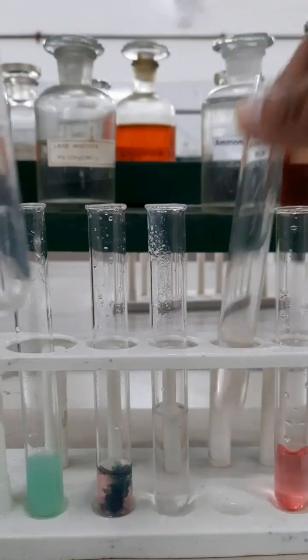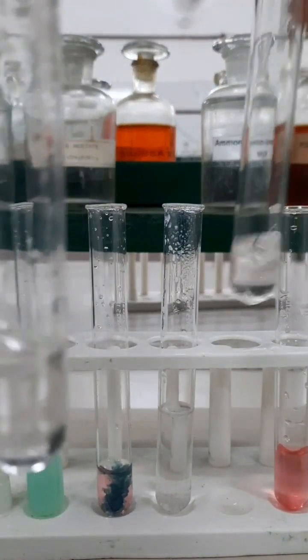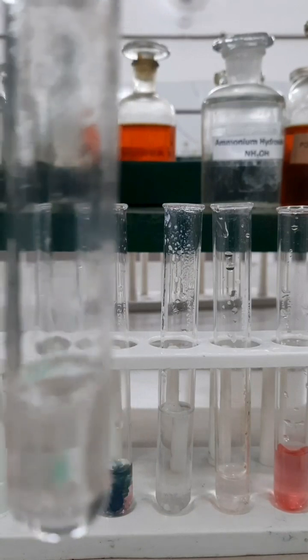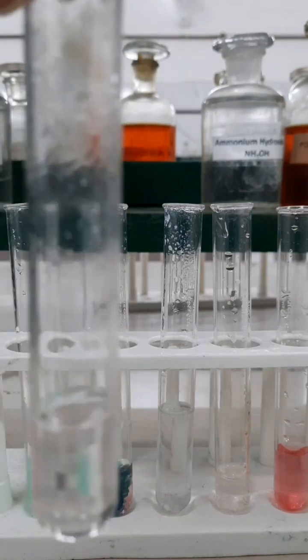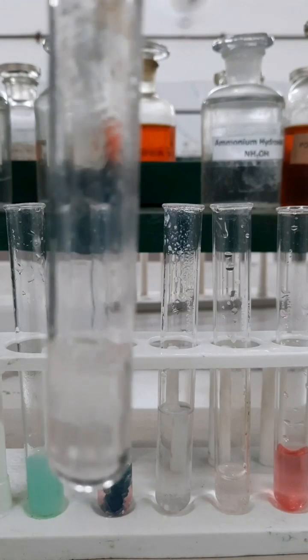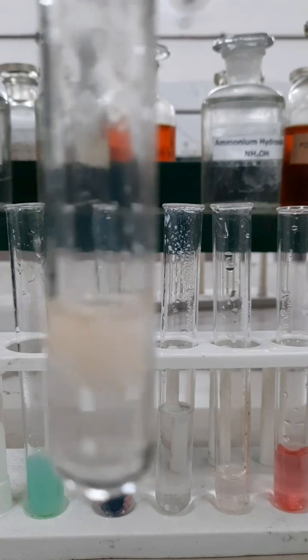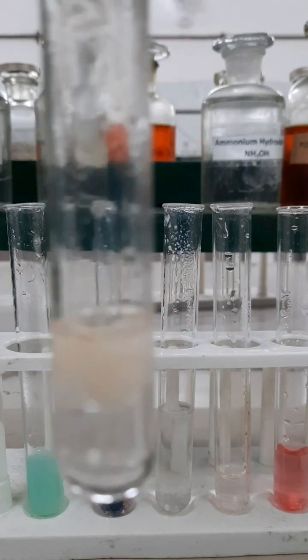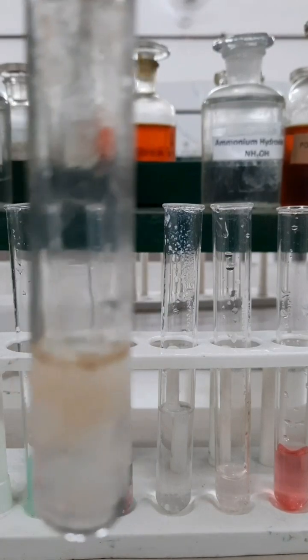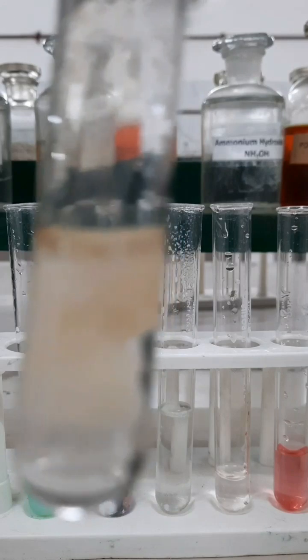Now the fourth test tube contains Mn2+ ion. I am taking 1 ml of a solution containing Mn2+ ion and I am adding sodium hydroxide solution into it. After adding sodium hydroxide solution, a buff colored precipitate of manganese hydroxide will be obtained and that will turn brown due to aerial oxidation and the formation of manganese oxyhydroxide.